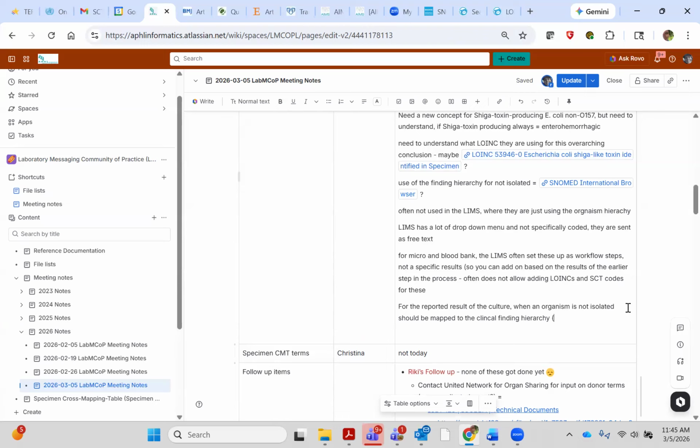On the first scenario, when it's an OBX8, that field is also free text, and they're using the HL7 table for the SRI, and there's no capability in the LIS currently, as far as I'm aware, that can map that to a SNOMED code. That's something else: the same value in two different fields, how it's set up, and how it gets reported in HL7 V2 messaging, I think should be mapped to the same SNOMED code the same way. And it's only half of them that are going to be mapped to the SNOMED code because of that lack of functionality in the LIS. So these are some of the things in Shield we might want to call out, when you talk about LIS functionality, what's needed to support some of these things at a very basic level. We'll get a lot of pushback from vendors, I'm sure.